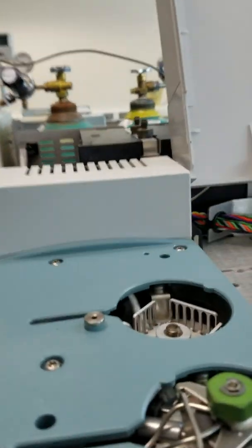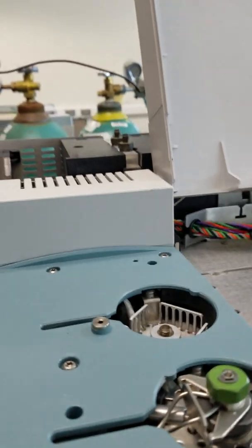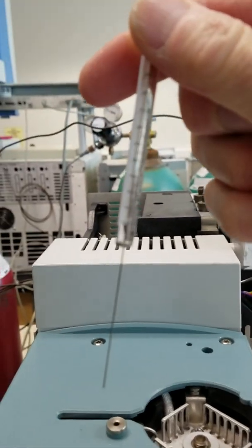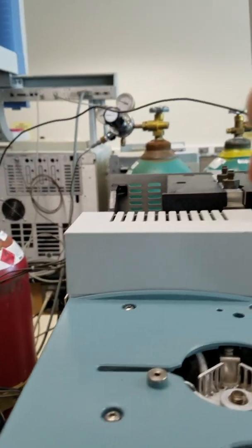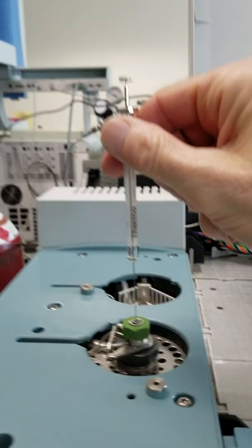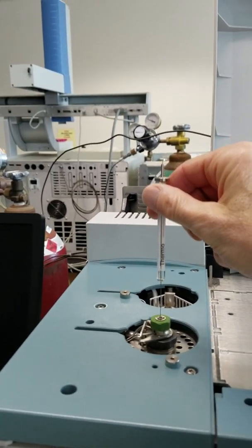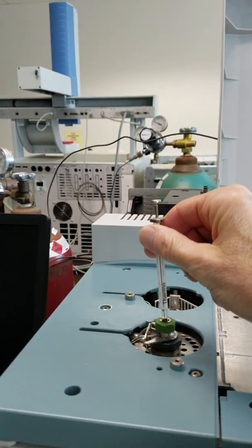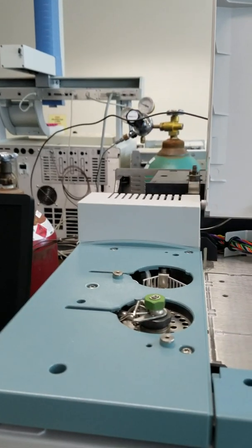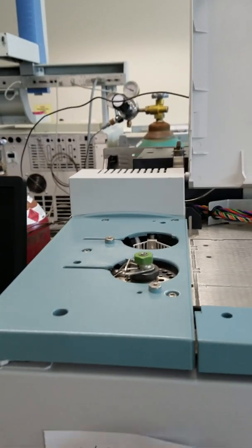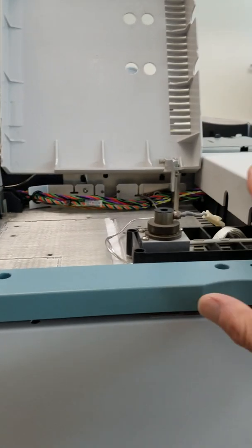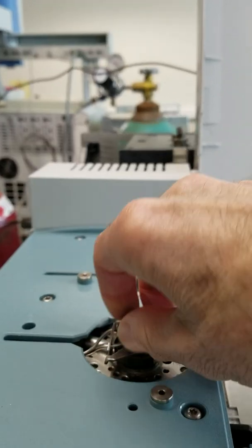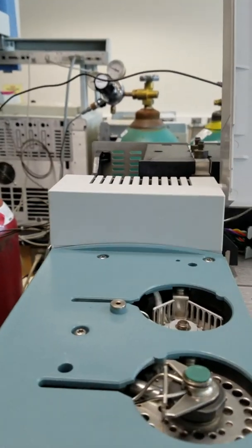I want to spend a minute on the injector. When you do the injection, you have this little 10 microliter syringe. It goes through a septum. You do your injection in the injector and introduce your sample into the system. Your sample runs through the whole system until it gets to the detector.